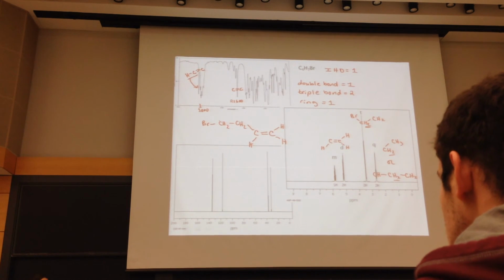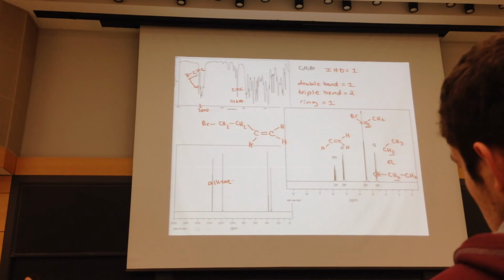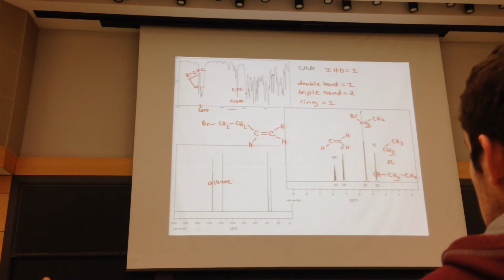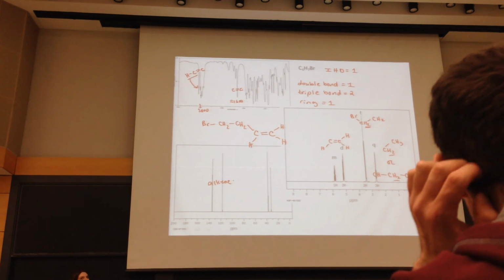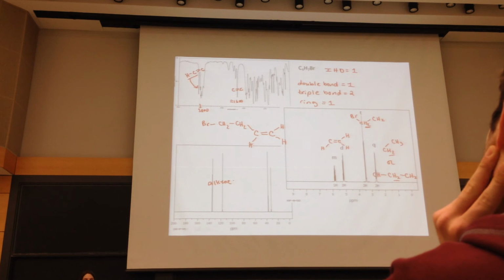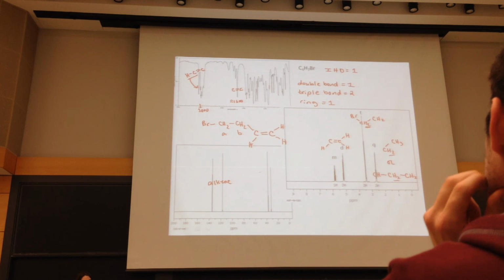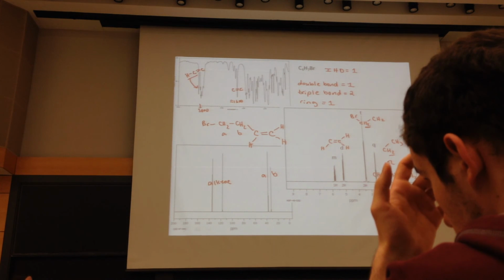Or, in this case, if you said that these are in the alkene, I'm going to give you the points. You're telling me that those are the 2 carbons in the alkene region. That's the information that I want you to get from the carbon NMR. Here, you should be able to identify which is which signal because of the alkene. So if I make these A and B, the carbon directly attached to bromine, you're attached to the electronegative atom, you're more deshielded, you should have a higher ppm value.